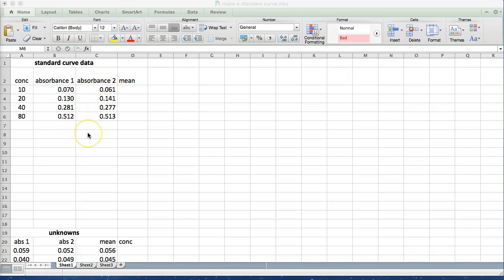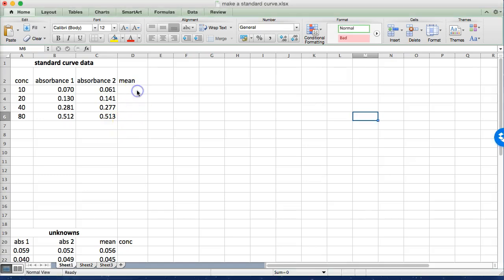Now obviously I'm not going to plot both of those. I've done it in duplicate to increase the accuracy of my actual reading. So the first thing we're going to need to do is actually calculate the mean of these absorbance values.